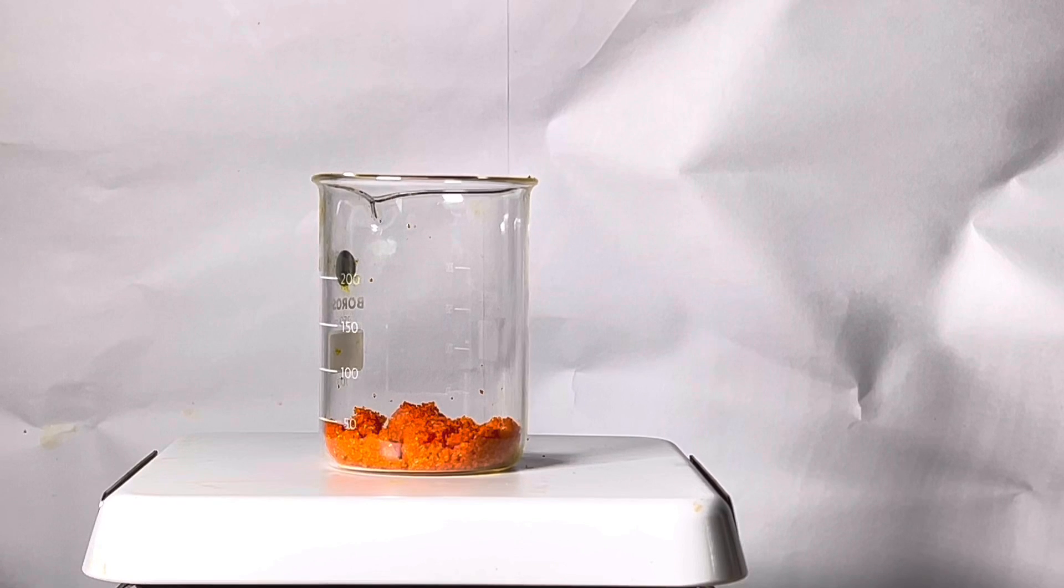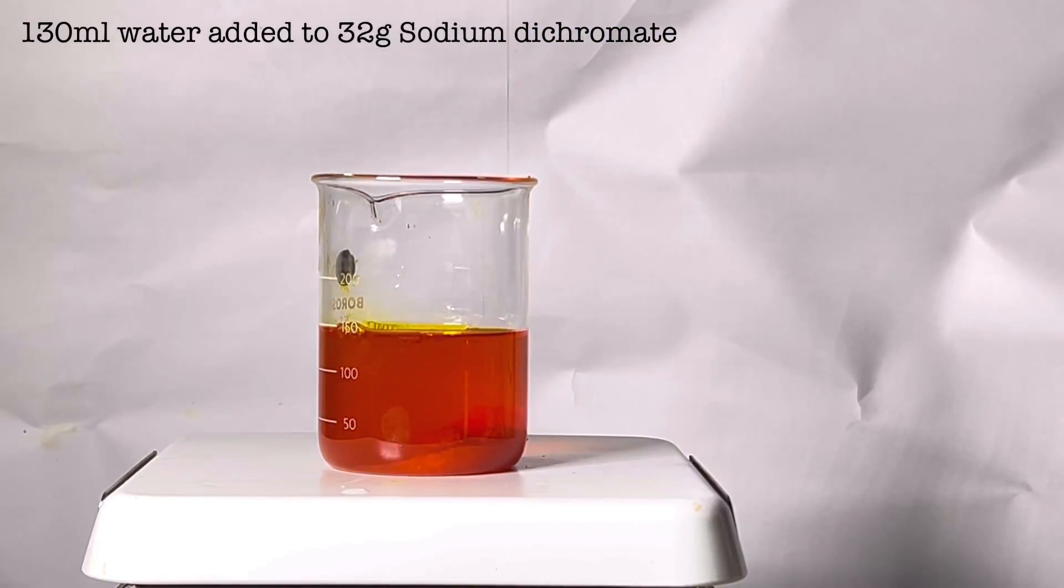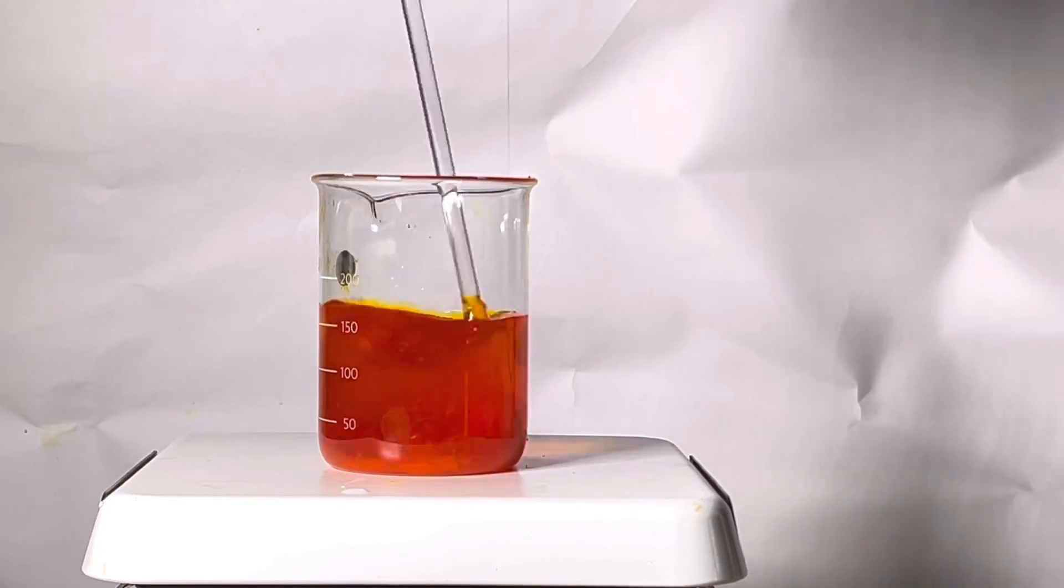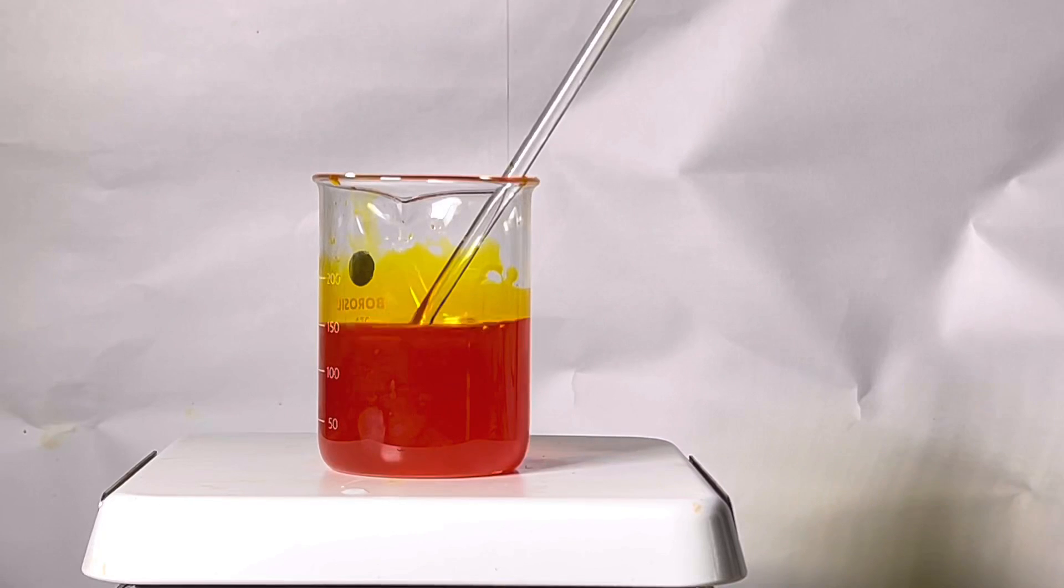First, we will make the oxidizing agent. Take 32 grams of sodium dichromate and add 130 milliliters of distilled water to it. Using a glass rod, the solution was stirred to dissolve the compound in water. Sodium dichromate is highly soluble in water and it very easily dissolves in it.